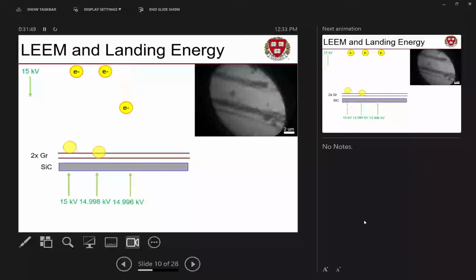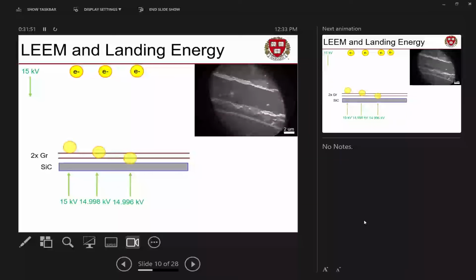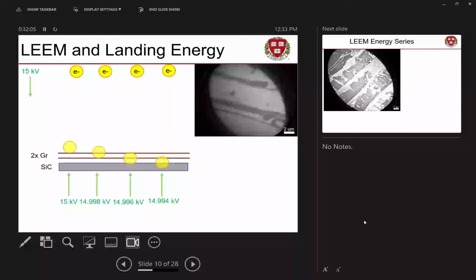And we can keep doing this. I can keep animating in PowerPoint for some reason. And as we do it, our electrons are going to get deeper and deeper into the sample, and we're going to interact with different states at different physical and energetic levels inside the sample. And we get a whole stack of pictures. And the point I'm making here is interpreting LEEM images is not trivial. You don't interpret one image. You do energy series, you do a bunch of other stuff, and then you sit there and figure out what it all means. This is not a very straightforward type of microscopy. It's very useful. You have to believe me. I'll show you why it's very useful.